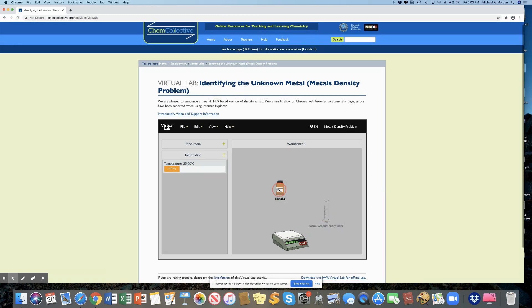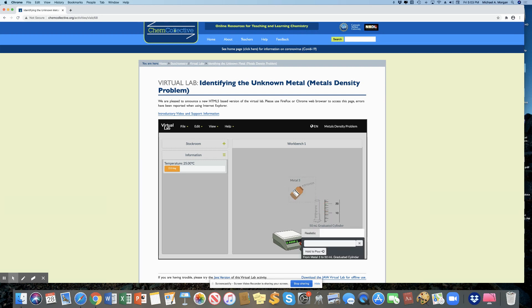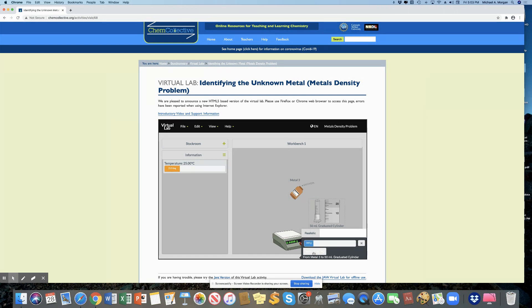Now I'm going to take the metal and I'm going to drag it. And you again, get that green circle with a little plus sign. And it means we're going to add it. And what you do here is you click on this button called hold to pour, and you're going to pour some in. And there's no exact amount about how you're going to do it. I'm just going to pour some in. I'm pouring some in. Now I'm going to stop.